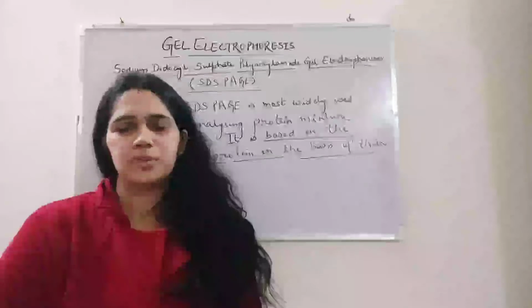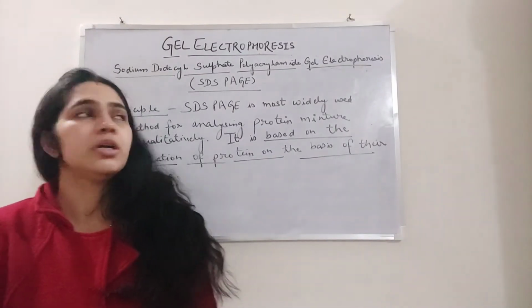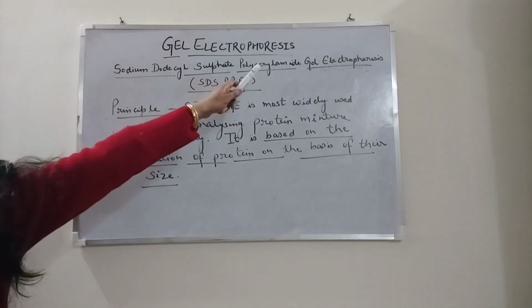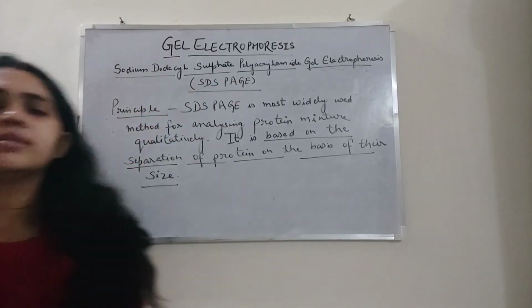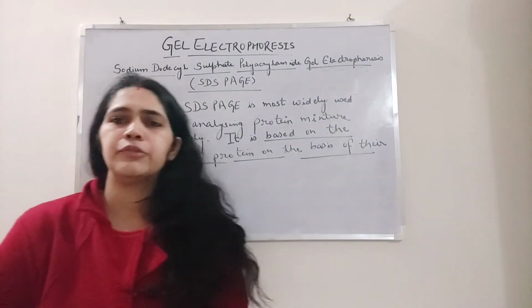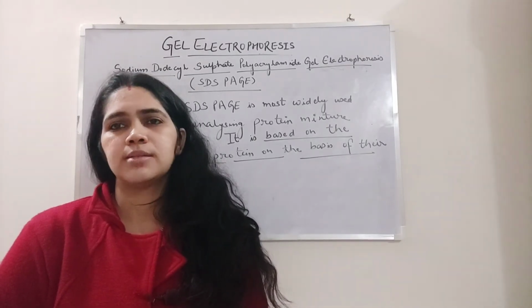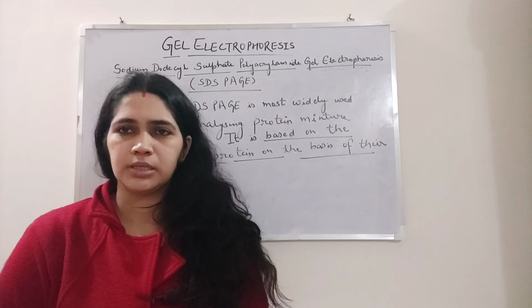Now let's start the topic SDS-PAGE, which stands for sodium dodecyl sulfate polyacrylamide gel electrophoresis. It is the most widely used technique for analyzing proteins qualitatively, and it is based on the separation of proteins on the basis of their size.